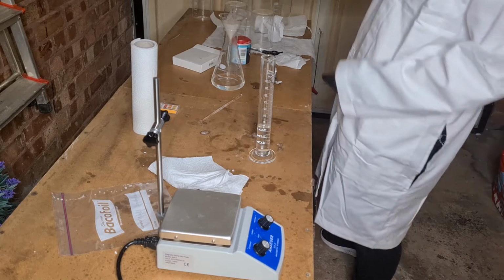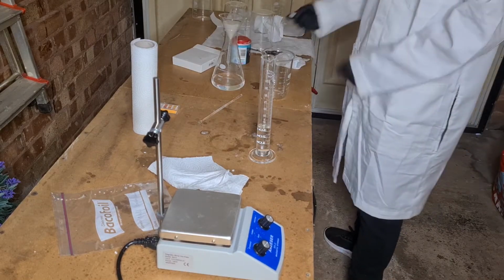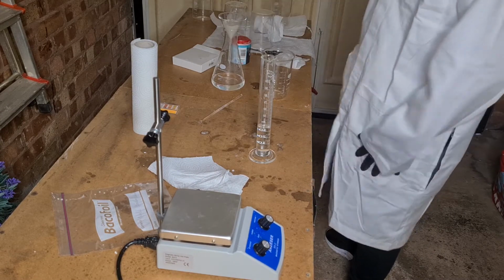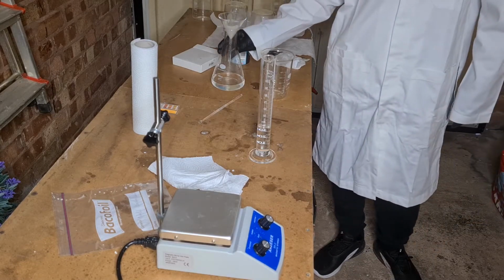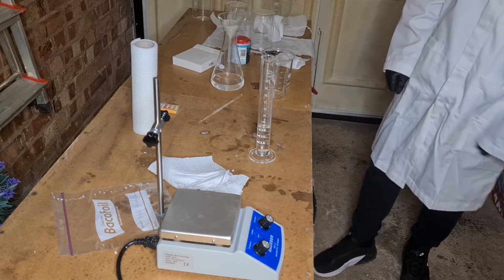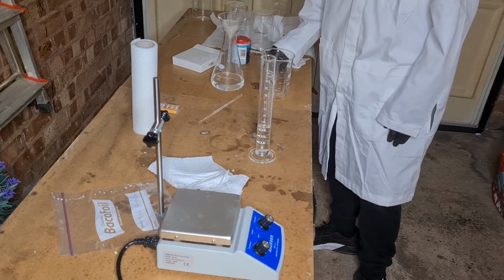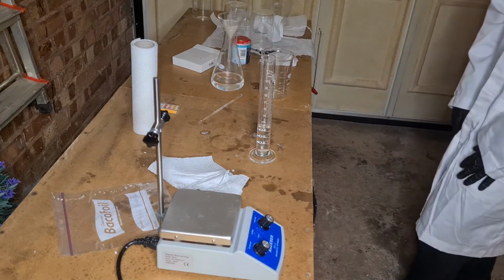See, I would do some more washings of this, but I'm really lazy. Also, there's no sodium, there's nothing on there. So once all this is filtered, which the last bit of filtration always takes the longest, it feels. I know, it doesn't actually, but that's how it feels. But when it's all done, we will be able to do cool things, says me.